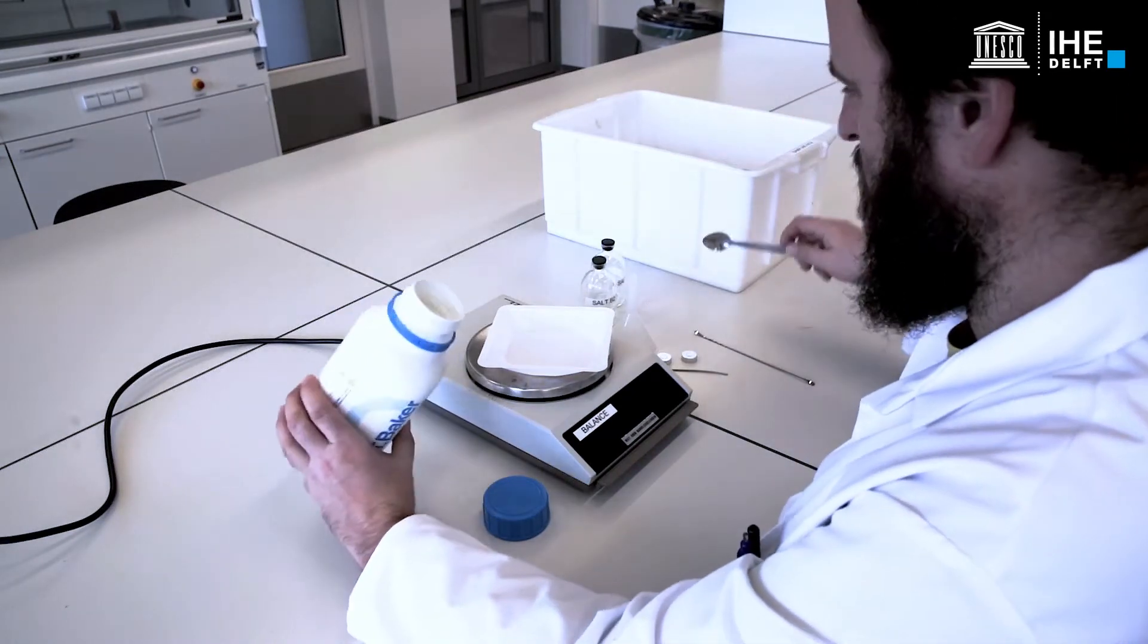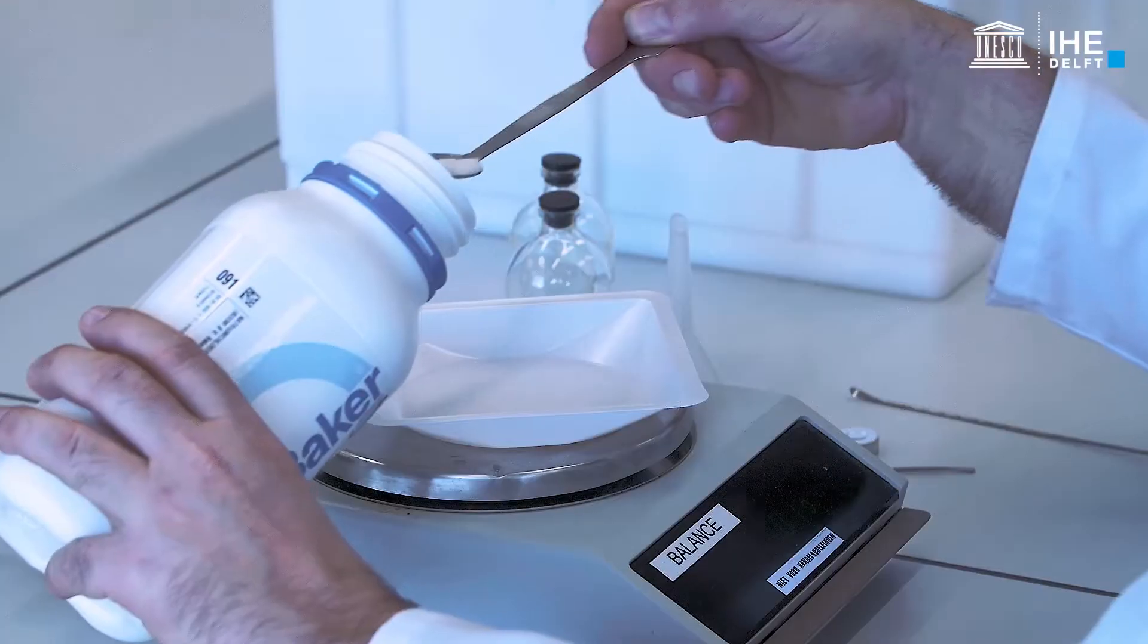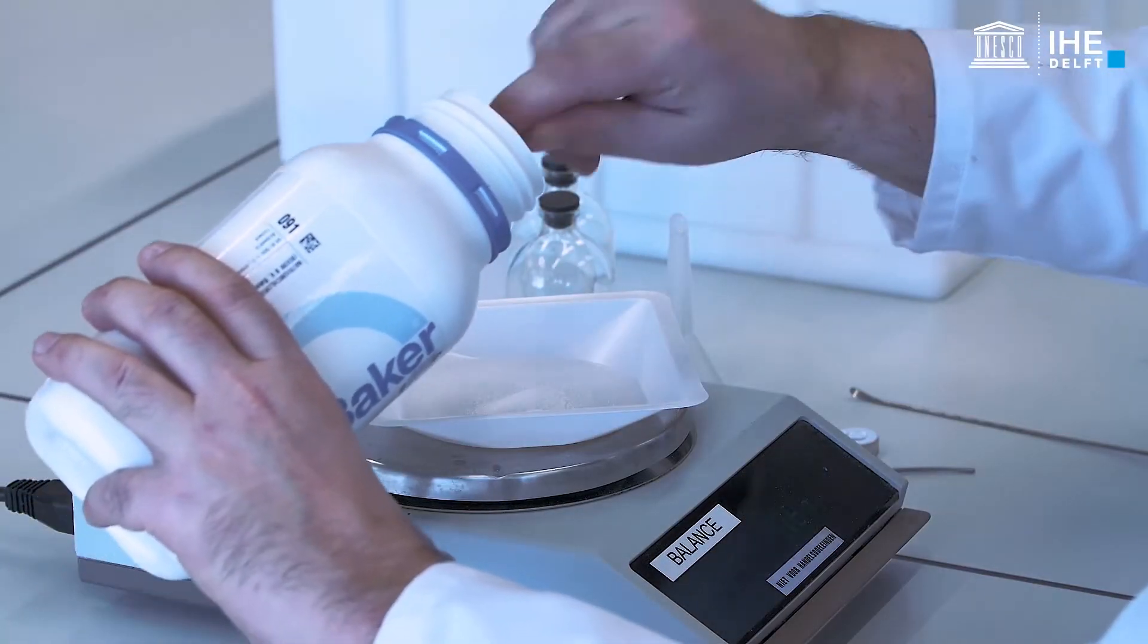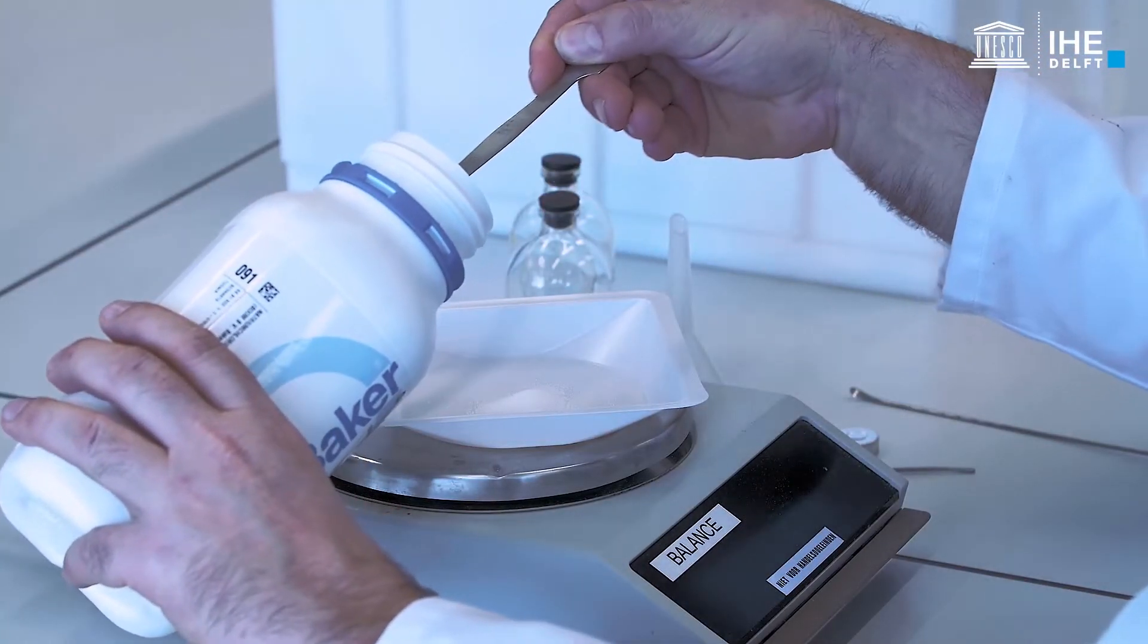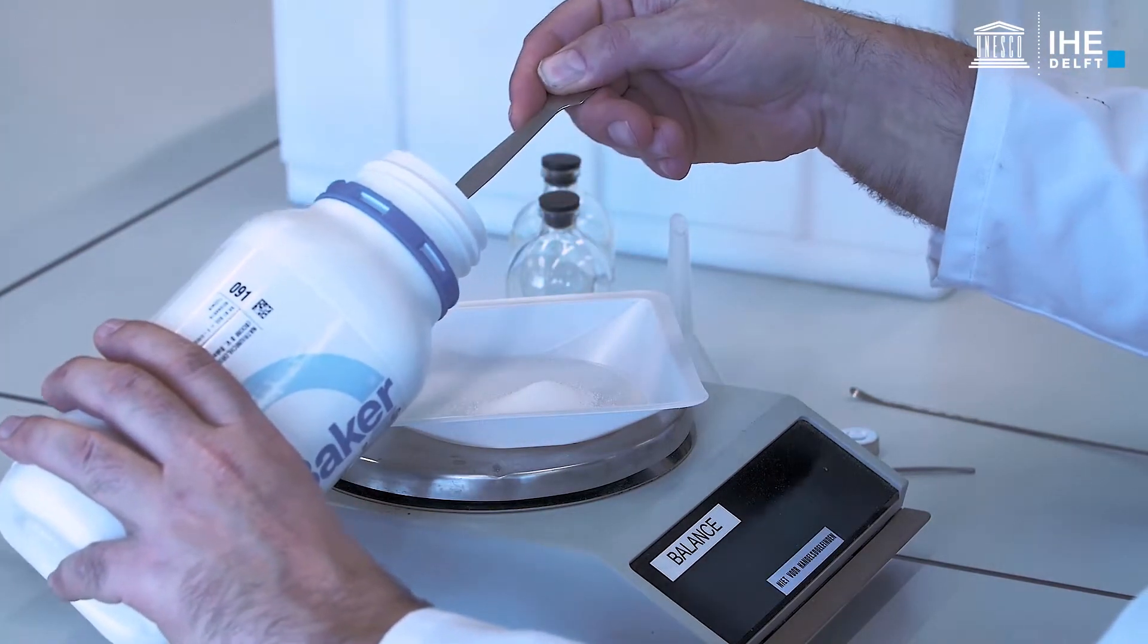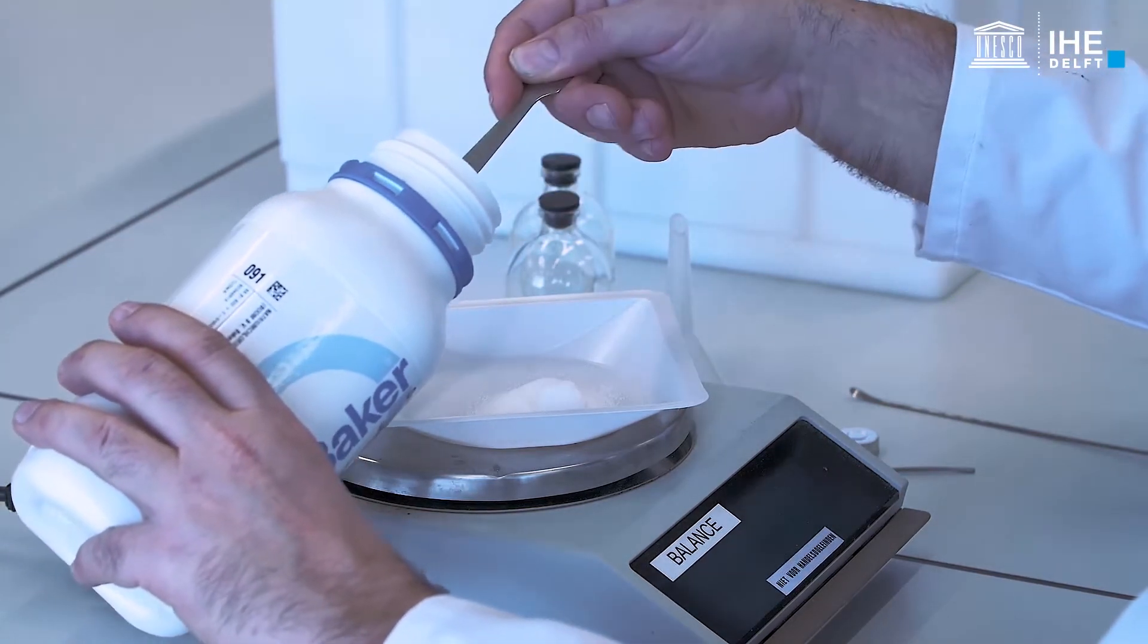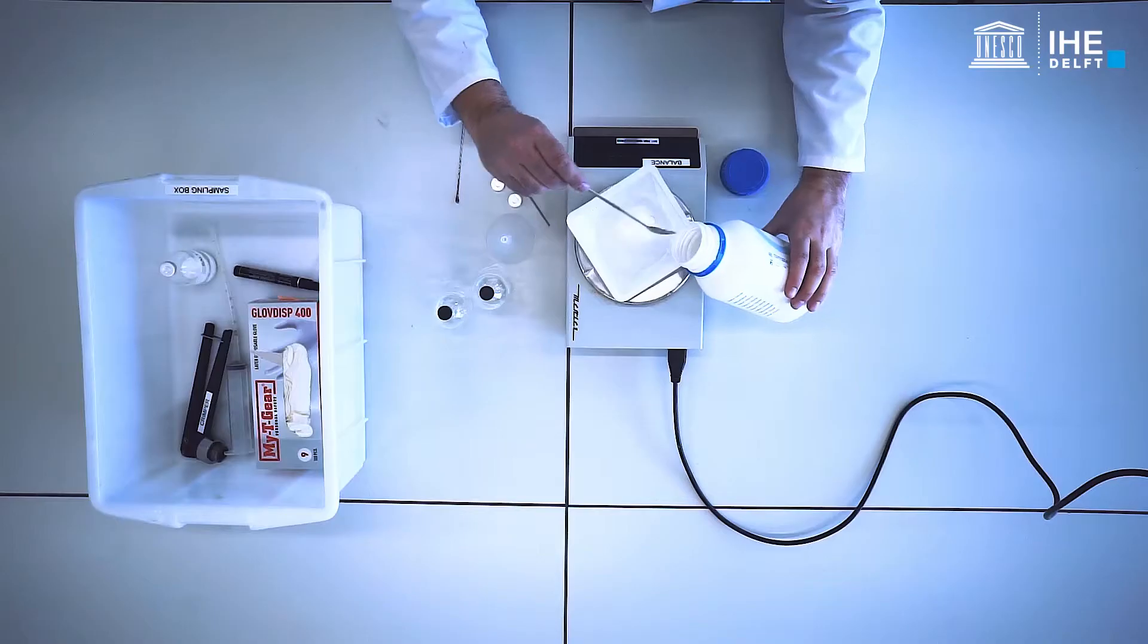The salting out method for the determination of dissolved gas concentrations is performed in 120 milliliter serum bottles. First, weigh and pour into the serum bottle 20 grams of sodium chloride.